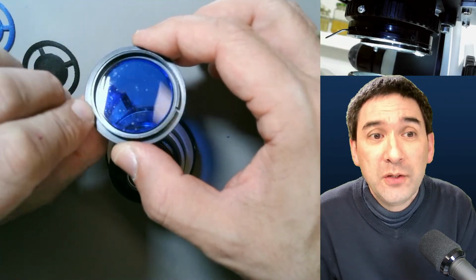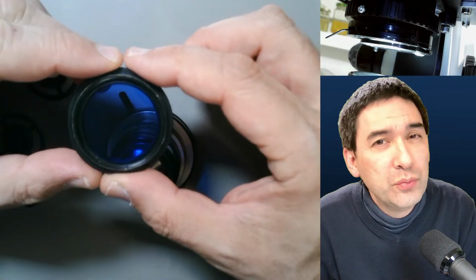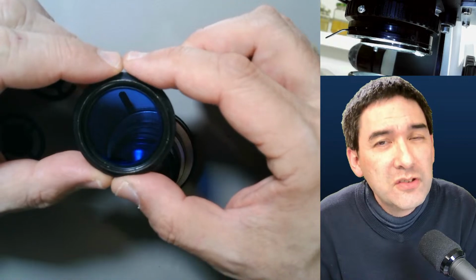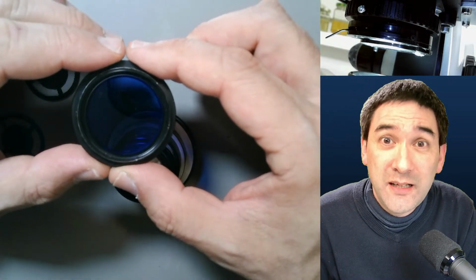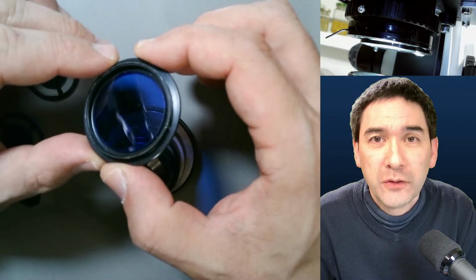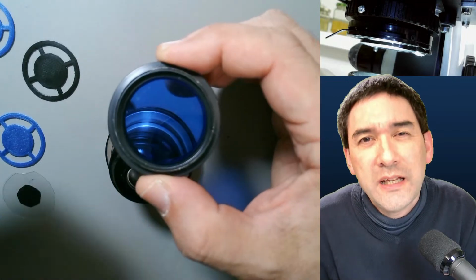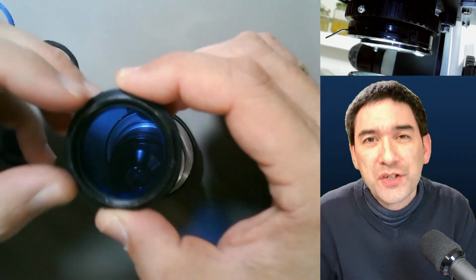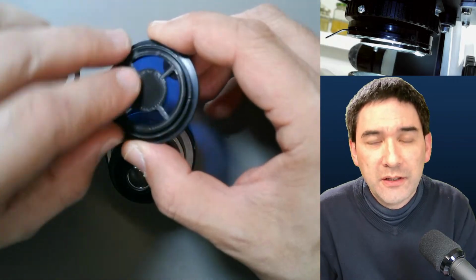I know that many LED microscopes these days also come with a blue filter. I don't really see much of a point in that because LEDs already have a more balanced light spectrum. But for halogen lamps, a blue filter actually is quite good to have because it also removes the heat radiation, the infrared part, which actually causes the specimen to heat up. So basically I'll just put this in here and then we're ready to go.